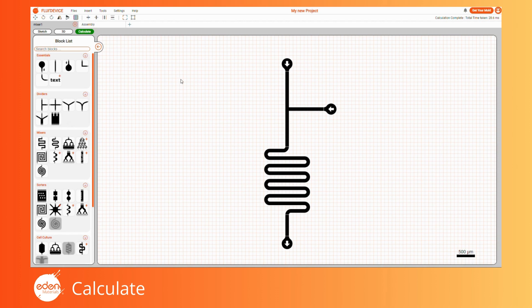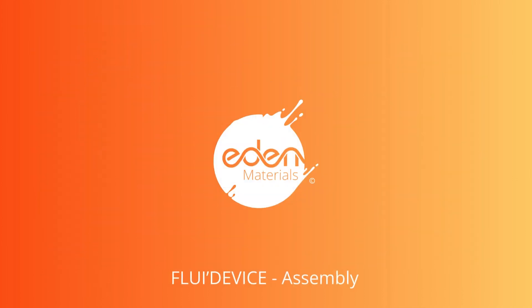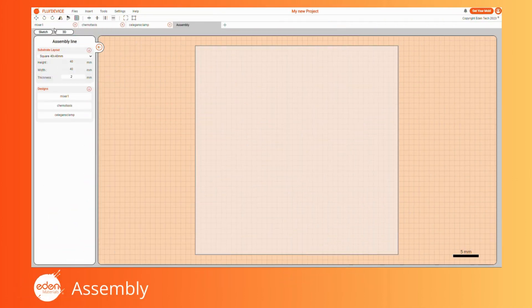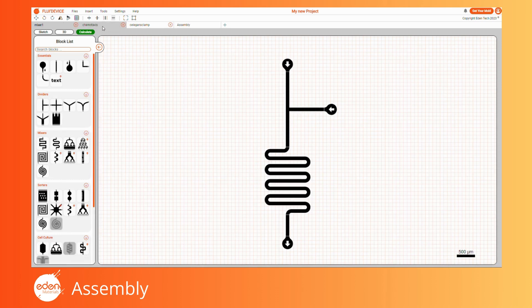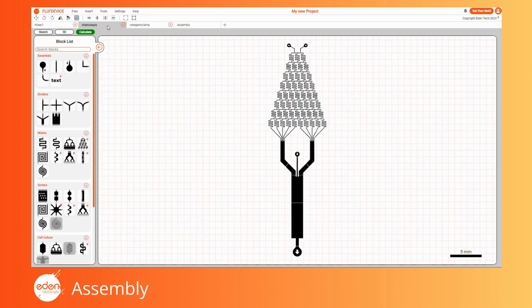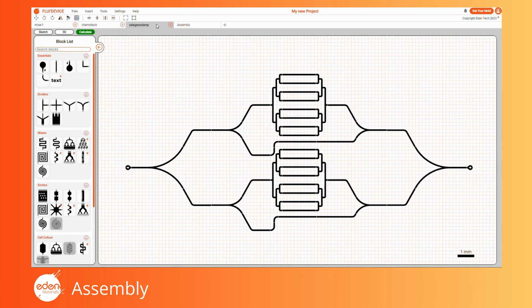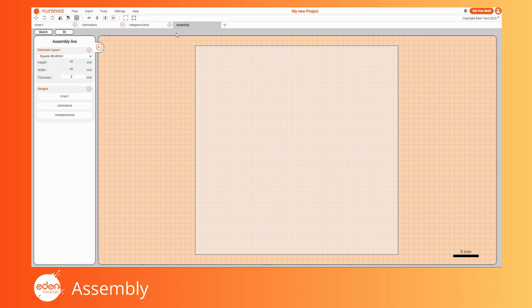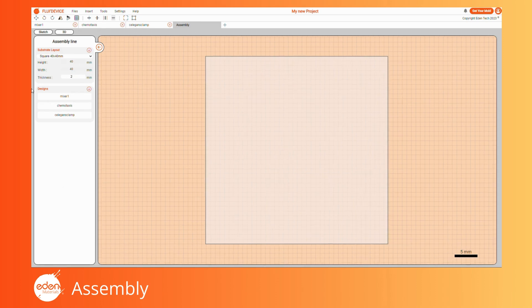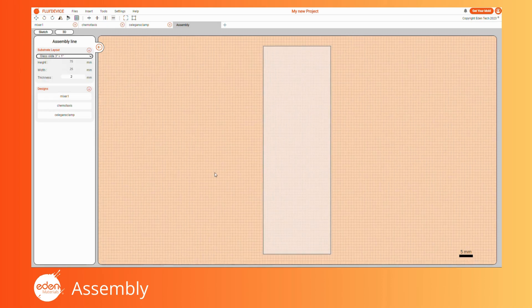Once you are satisfied with the result, it is time to build multiple designs. In microfabrication processes, it is not uncommon to fabricate multiple designs onto a single substrate, whether to optimize space or to observe multiple events simultaneously. In FluiDevice, once you have created multiple designs, you have the possibility to bring them all together. To do so, click on the Assembly tab. Upon opening the Assembly tab, the left menu is replaced by the Assembly Line menu. Here you can choose which type of substrate you would like to use, whether predefined ones such as glass slides or 4-inch wafers, or custom ones.